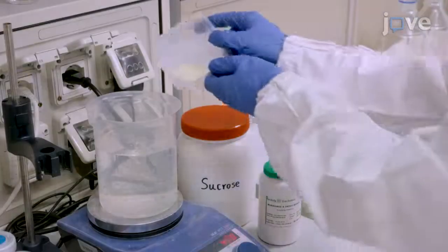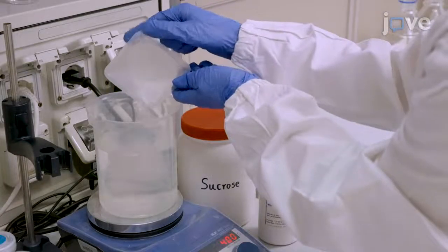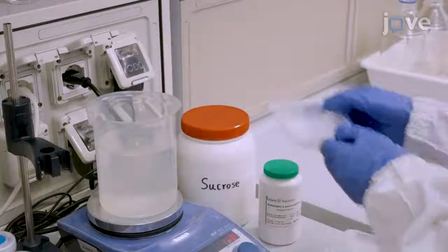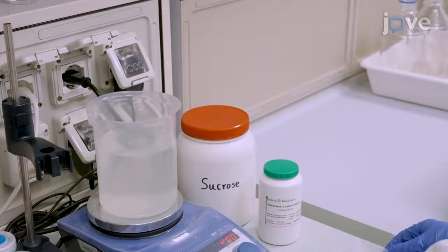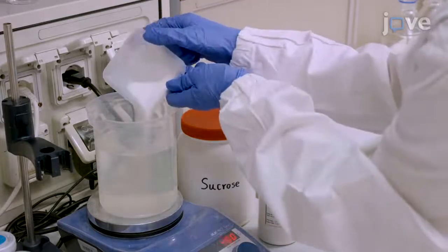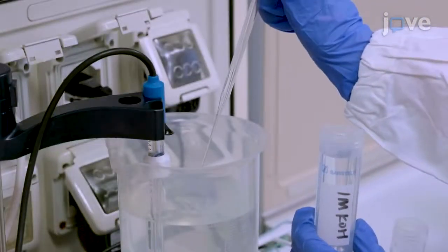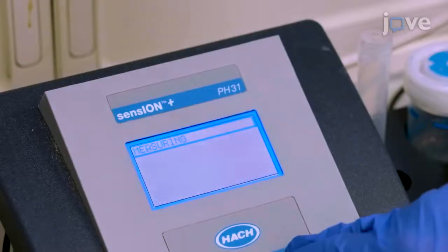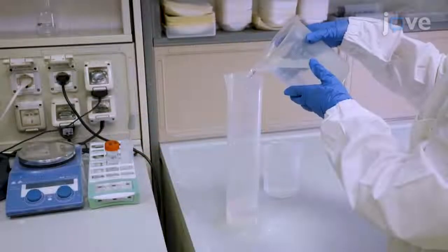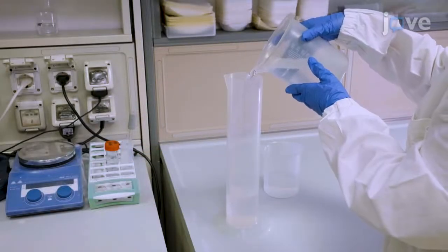Next, prepare half-strength Murashige and Skoog medium by adding 2.2 grams of MS medium powder, including vitamins, and 10 grams of sucrose in 800 ml of distilled water. Adjust the pH of the medium to 5.7 using 1 molar potassium hydroxide, then bring the volume up to 1 liter using distilled water.